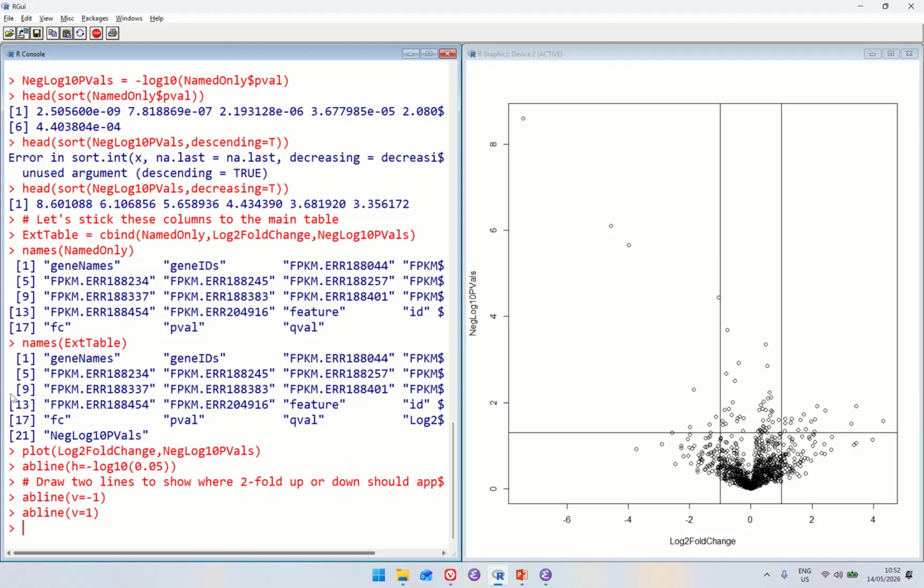Okay. So here, p-values that are below 0.05 appear above this line. P-values that were higher than 0.05 fall below this line. So already your attention should be going to, okay, these are hits. Things below this are non-hits.